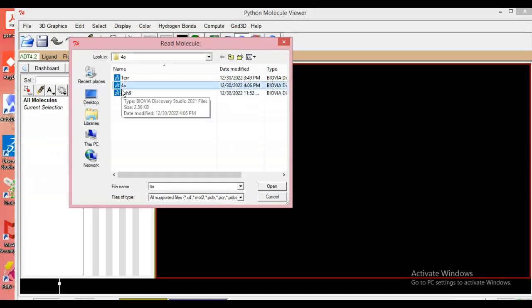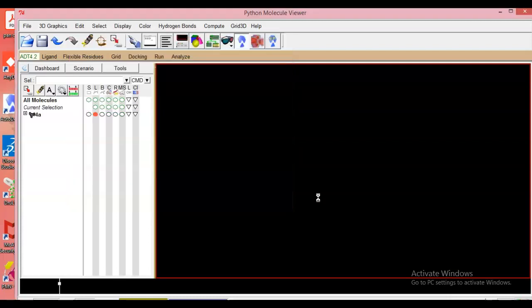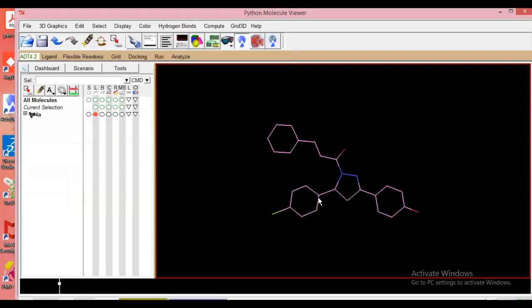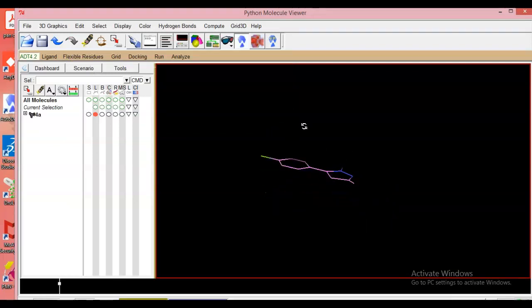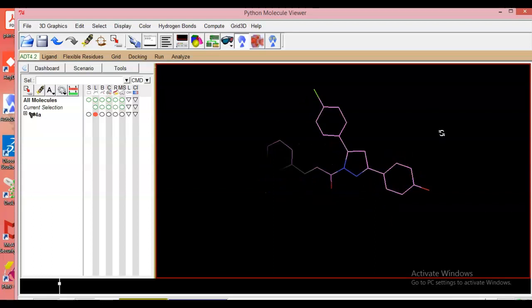If you want to load a molecule in this application, you have to click on Read Molecule. For example, there is a molecule called '4A' that I previously worked with in this application. Here I am going to show you how it is represented. Look at this — this is the molecule that I loaded in this application.